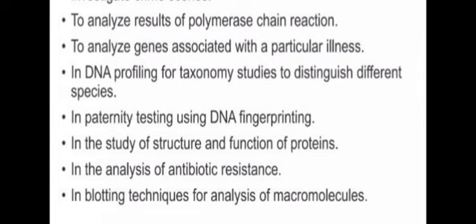The polymerase chain reaction is analyzed, and a particular gene associated with a particular illness can be analyzed in DNA profiling, for taxonomy studies to distinguish different species. In paternity testing using the DNA fingerprinting.